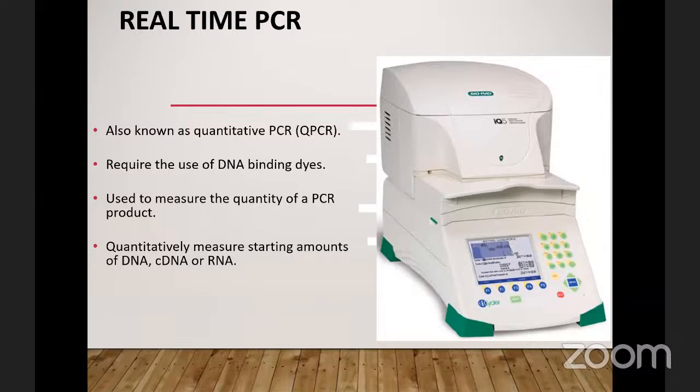But in real-time PCR, apart from the fact that you are able to see the PCR product as amplification is happening, you are also able to quantify the starting material. So if I'm going to do, for instance, a viral load analysis, I want to check what the viral load is on this sample, then real-time PCR is the best bet, or quantitative PCR. Because apart from viral load, I can also use the cycle threshold value to monitor the progress a patient is making during treatment.